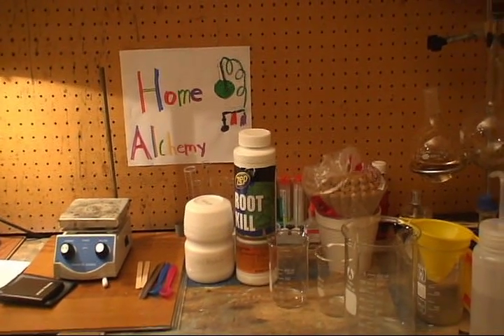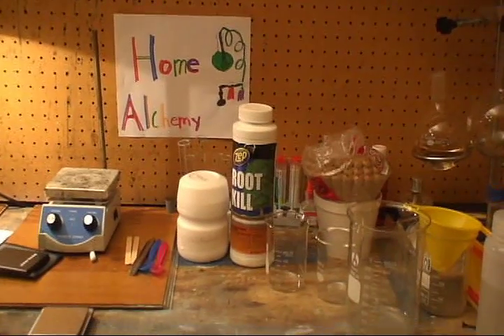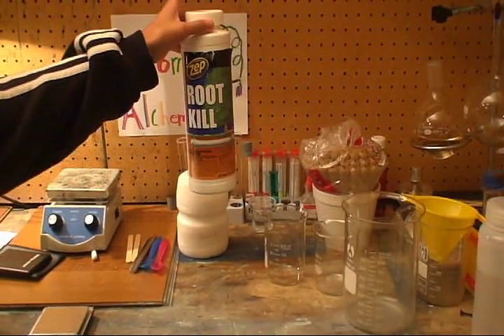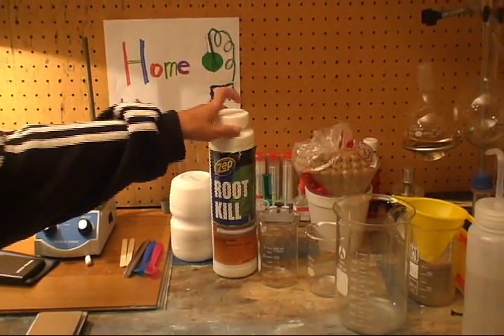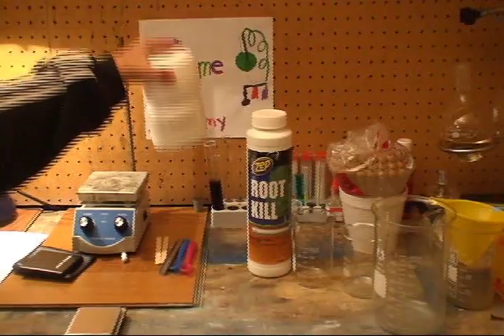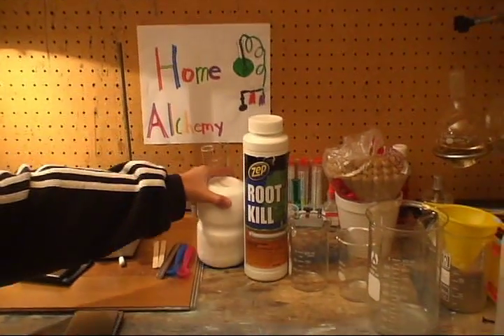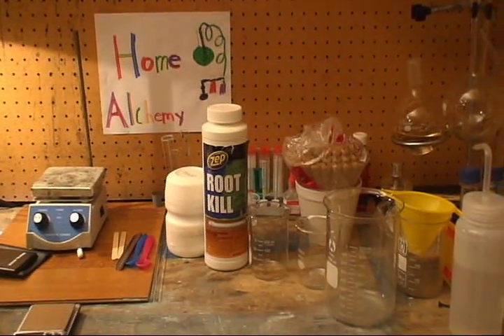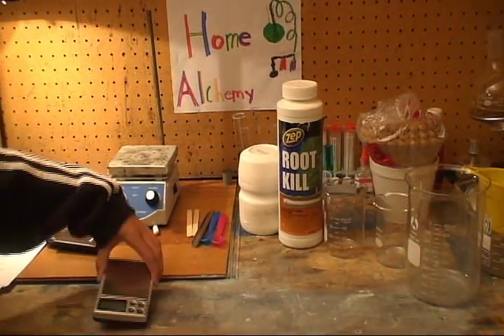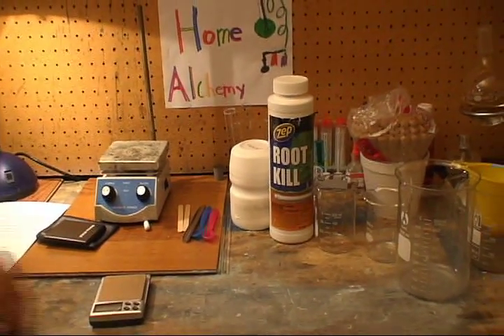These are the materials and chemicals needed. You will first need copper sulfate pentahydrate, also known as root killer. You will also need sodium bicarbonate — baking soda. You will also need a digital scale and a one-liter beaker.